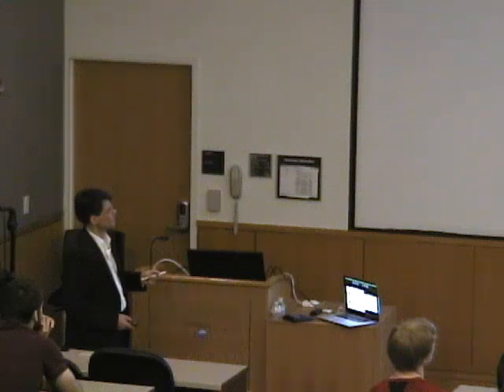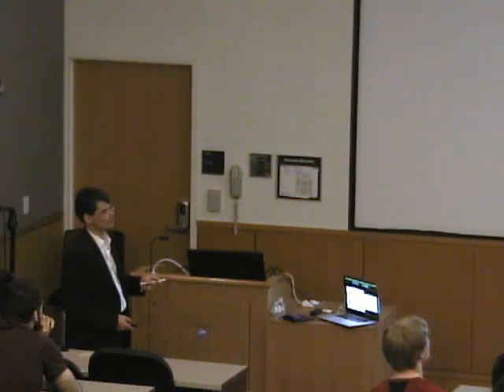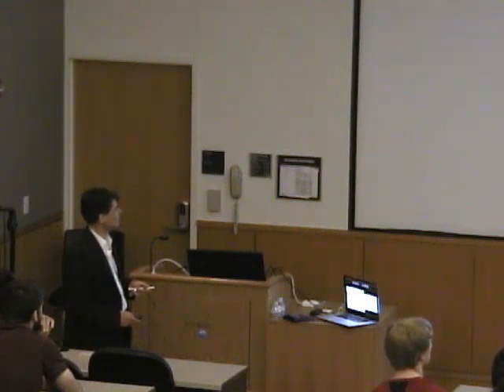Please notice that, take this to heart. This is many orders of magnitude larger than these splittings. You have a huge excitation energy and very tiny little splittings, and MCD is sensitive to both of these, and that's great.